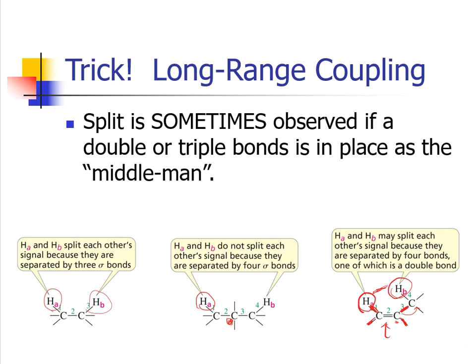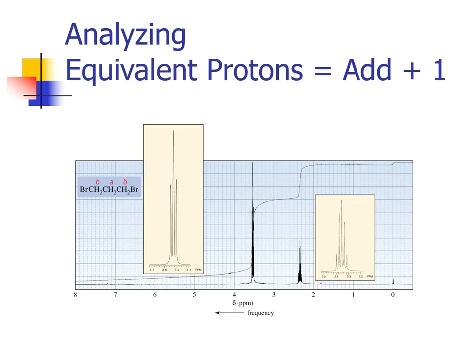So just keep in mind that NMR is not perfect. NMR is not going to be a, yes, this is a definite every single time that we do it. There's all of these exceptions that are out there that begin to happen. And these exceptions we have to kind of start looking at and just taking it with a grain of salt and moving on. So this is not by far the way that we identify chemical structure, but it's just one tool that we can add now to our MS and our IR tool to identify or help deduce a structure of a compound that was analyzed.